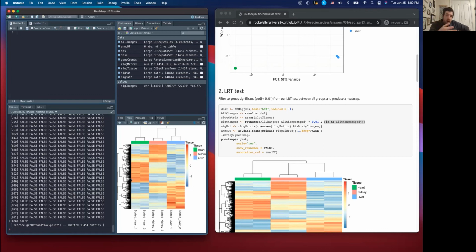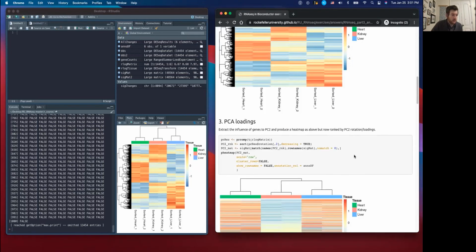So that is kind of the answer to that. With these kind of global things, the filtering and trying to hone down, it's just never going to be perfect. And so sometimes you do penalize against potentially interesting things, but on the whole, it's typically worth it. And it's typically not worth parsing things at such a fine level to make sure you can eke out every single potential comparison. I hope it makes sense, Charles.